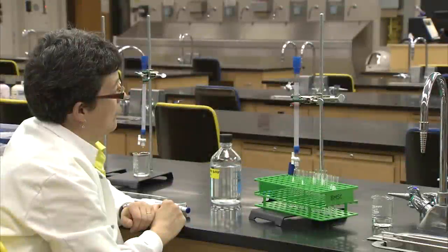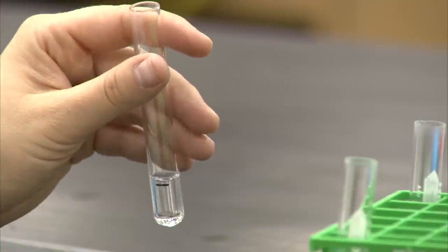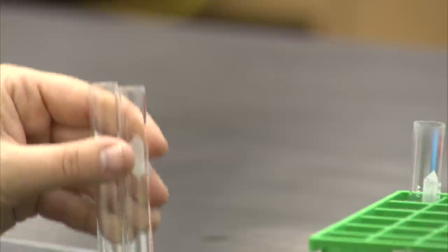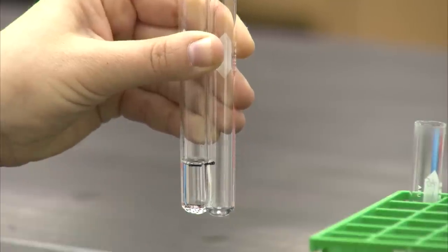When the experiment is proceeding, we will be collecting a series of fractions, each of the same volume. The task can be made easier by measuring a volume into one tube, and using that height to mark off several additional tubes, so they are ready to be used during the experiment.